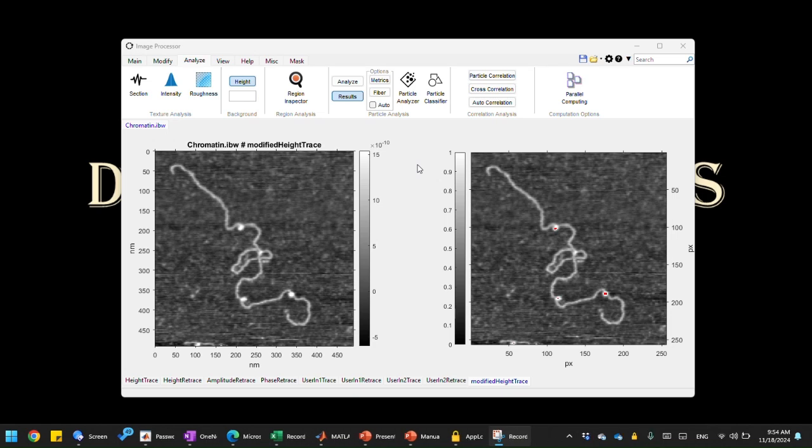In this video, I am going to show you how to use manually cropped regions as input to the particle classifier. This feature is useful for manual input because sometimes it is hard to mask the features that we want using automated analysis. So in that case, we have to manually crop the regions of interest that we want to use for our particle classification.